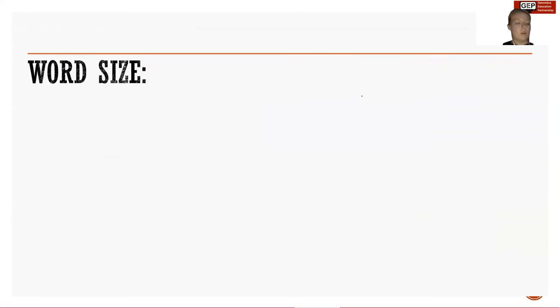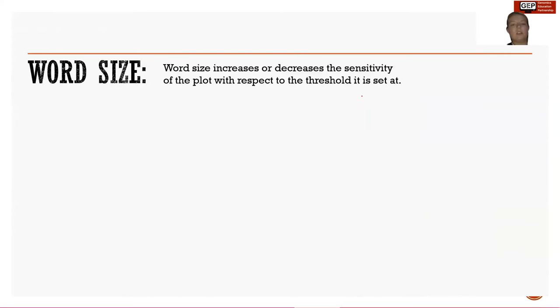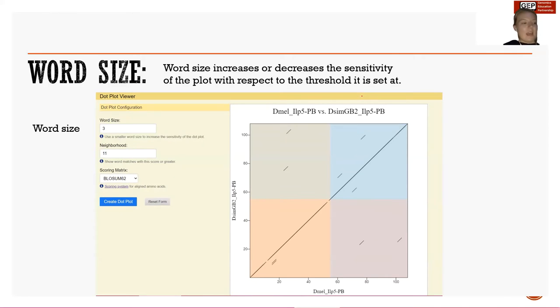Before going more into depth on dot plot patterns, it is important to note word size. Word size is important because depending on what you have set, we might see different things happening in the background of our dot plot. Word size essentially increases or decreases the sensitivity of the dot plot with respect to the threshold it is set at. We see word size and below it we see neighborhood — also referred to as threshold — which is based on a scoring matrix that creates a score for each position of the word size.